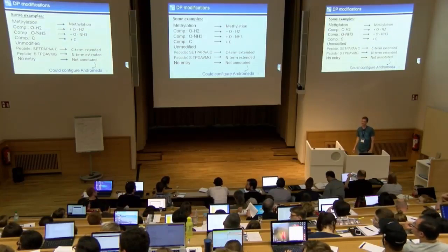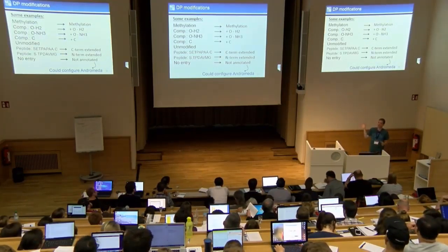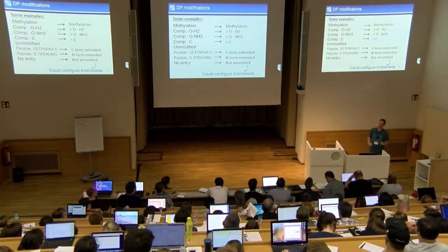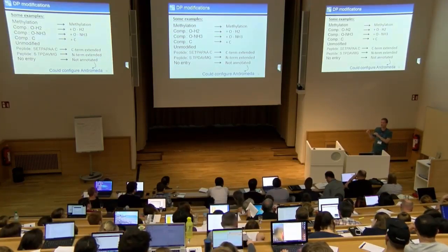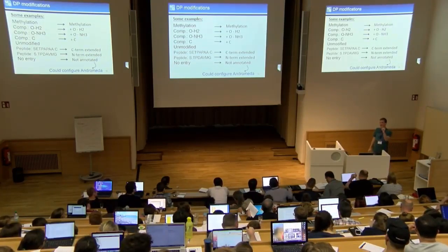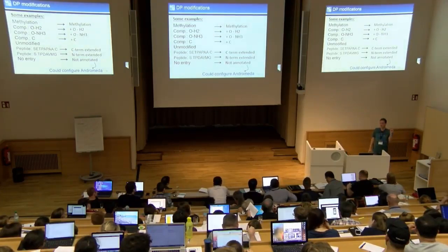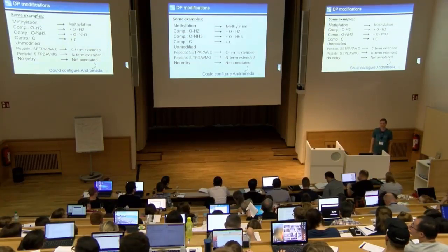But how do you identify that this is the size of the modification and this is exactly the same peptide as before? Yeah, so I try to explain this here in a two-step process, but this is actually done in one step. Just to make it less complicated, I try to split it up. But exactly, we have this picture with all the arrows where we try to match our unidentified spectrum, and there we actually consider all different positions inside the peptide as possible locations of the modification. Okay, thank you.